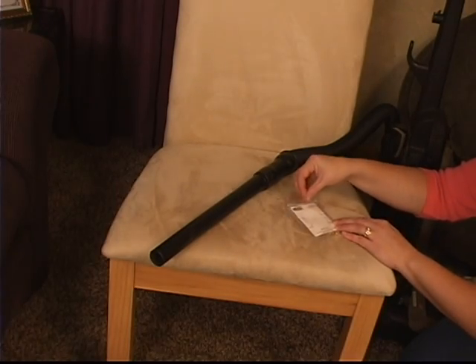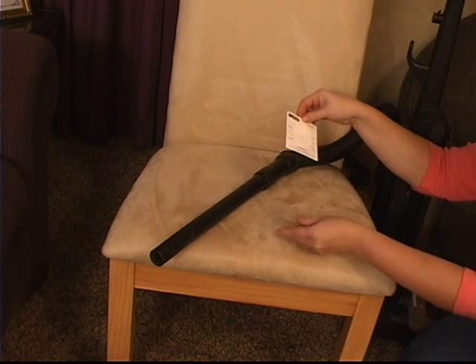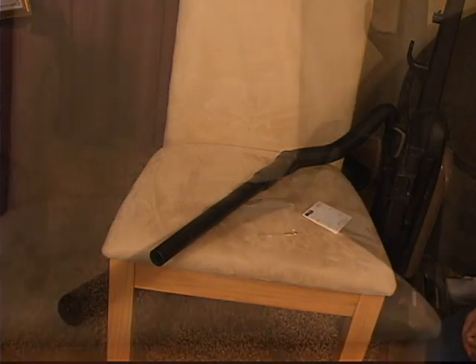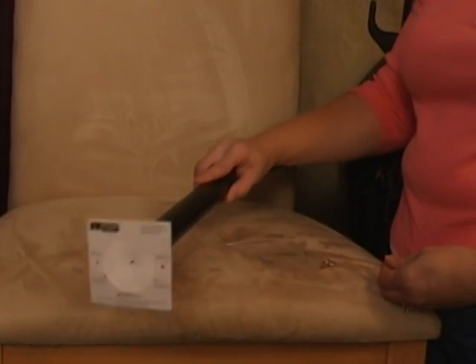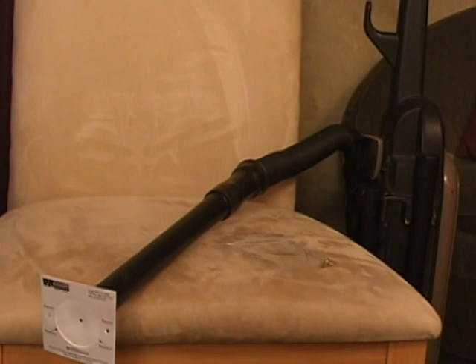Step 2. Turn on the vacuum cleaner. Step 3. Remove the Jossam Sampler from the protective sleeve, making sure you do not touch the center filter. Save the protective sleeve for return mailing. With the writing on the Jossam Sampler facing out, place the sampler in the center of the attachment hose end. The suction will keep the filter in place.